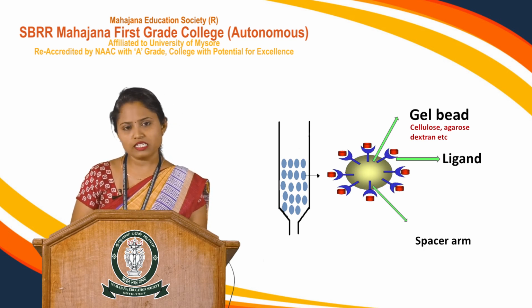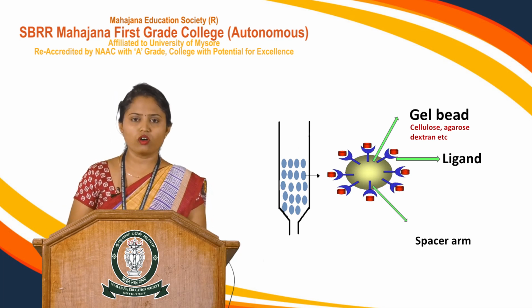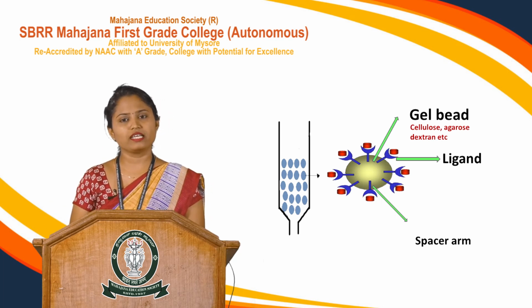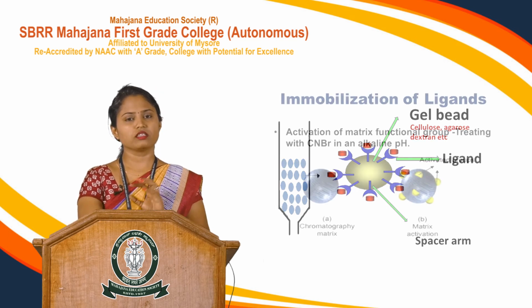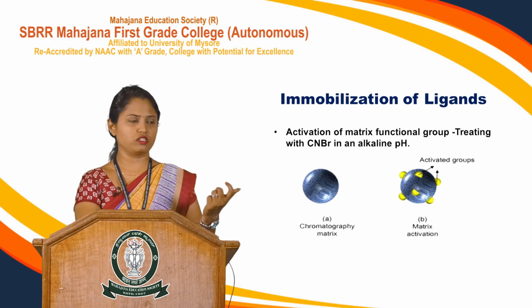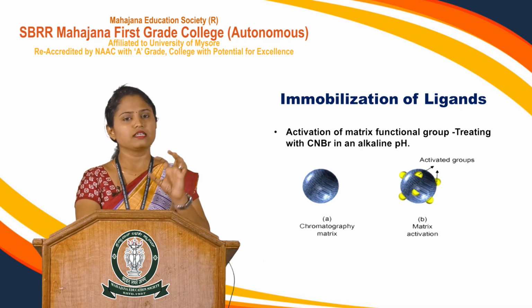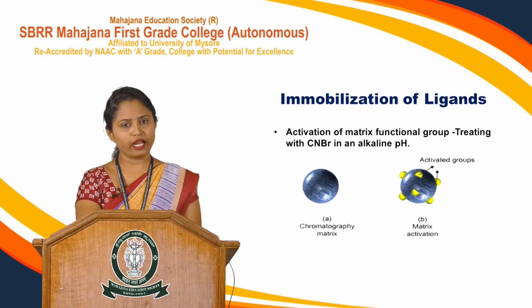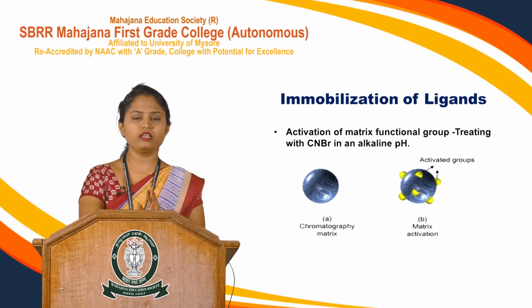Once the gel beads have been prepared, the next thing is you need to fix the ligands, and you call that step immobilization of ligands. This immobilization is nothing but the fixing, attachment or covalent binding of these ligands on the surface. But prior to binding of these ligands, the gel beads which you have prepared have to be activated beforehand. You need to pre-activate the gel beads.